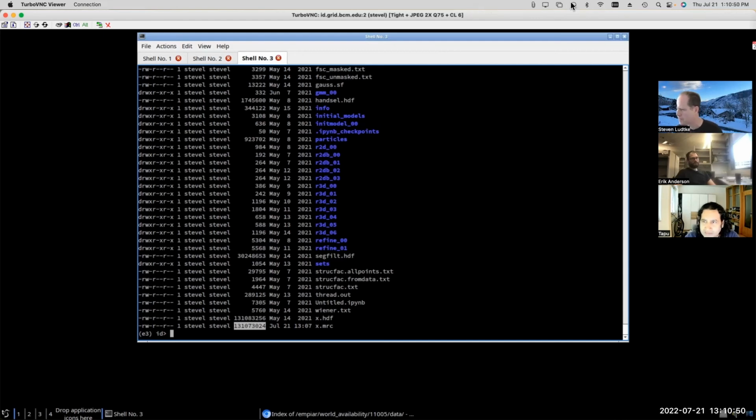Okay. And my second question is, for something like a class average, how would you encode an LST file from that? Because the members of particles that belong to a class can vary wildly. So would you point to a JSON file, or how would you do that? No. So that metadata that's stored in the LST files is basically a JSON block. I mean, if you have to maintain the same length for all lines in the file, one class may have 0 particles and another one may have 10,000 particles.